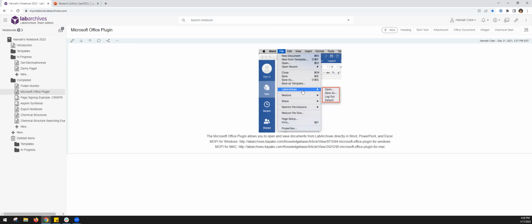But I want to pause before we switch on over to talking about actually working with the entries once they're in your notebook to see if there are any questions. And there's a great question for the Weill Cornell team. What is the maximum file size allocated to each user at Weill Cornell? Is there a limit to the file size? The total space, there is no limit. The file size, I believe, is 16 gigabytes. No, Anna? That's what we have, I think.